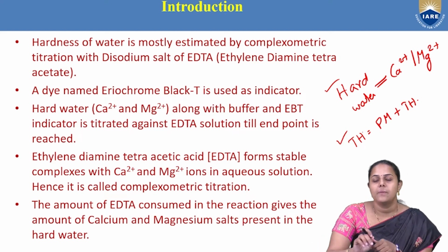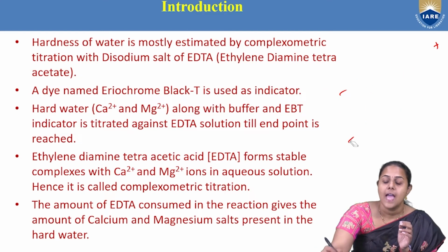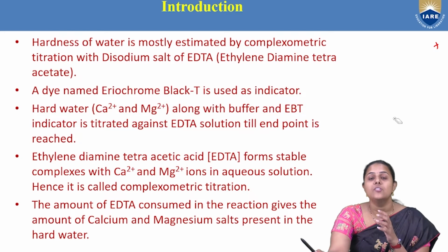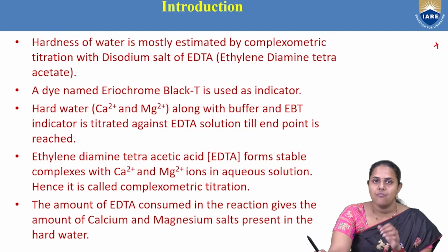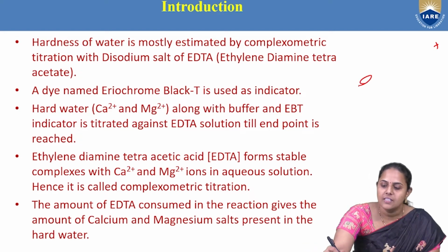So in this experiment, our aim is to estimate the hardness of water by EDTA. EDTA is the reagent used in this experiment. That's why it got the name EDTA method, because we will be using EDTA as a reagent in this experiment.